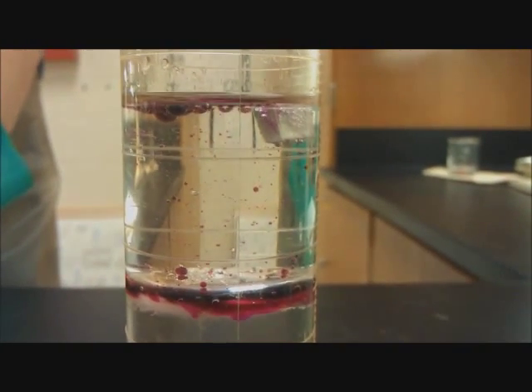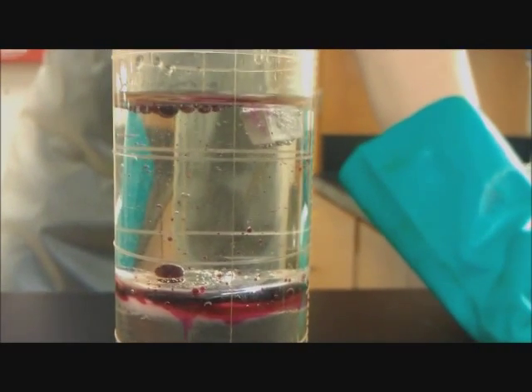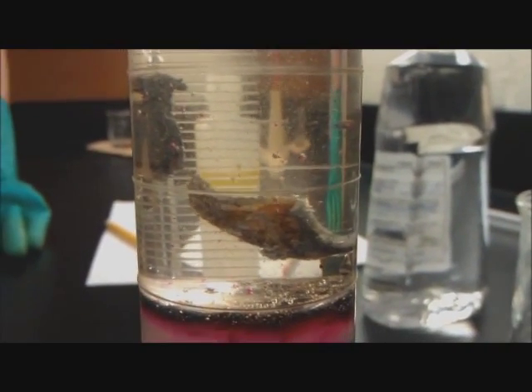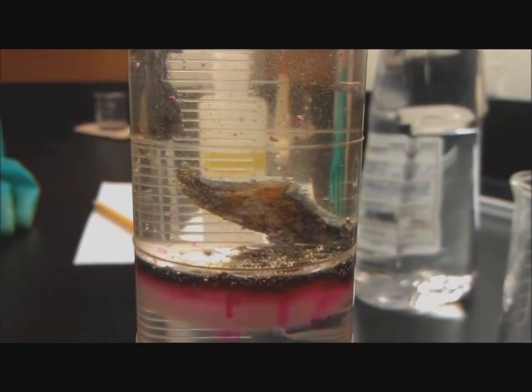Now it looks like the sodium is more reactive than the potassium. Why is that? Probably the age of the chemical. The sodium is at least five times more reactive — we had a smaller piece and it was way more reactive than the potassium. From what I've learned, it should be the opposite way.